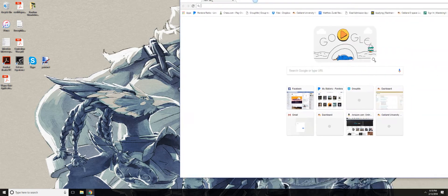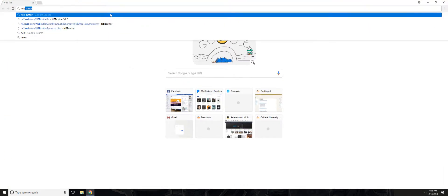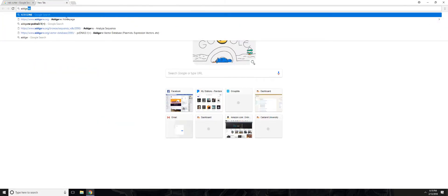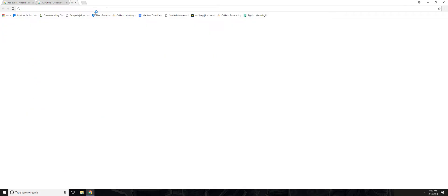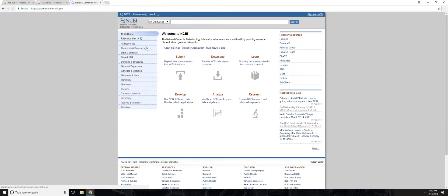So we need NEB Cutter, we need AddGene, and we need NCBI. Let's start at NCBI.